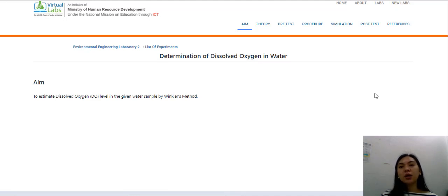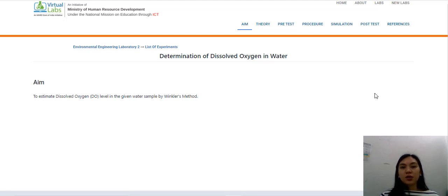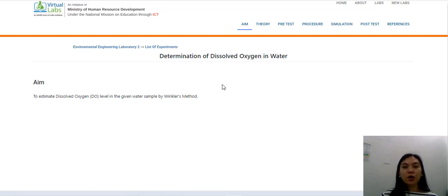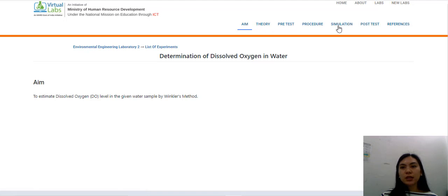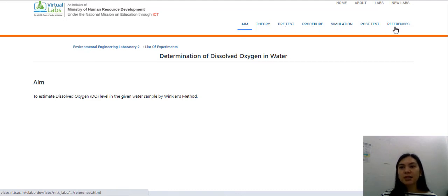As with any other simulation experiments that we had, I will be providing you a link that will prompt you to the site of the activity. It will first prompt you to the objective or the aim of the experiment. On the upper right side of your screen, you have your aim, theory, pretest, procedural, simulation, post-test, and references.